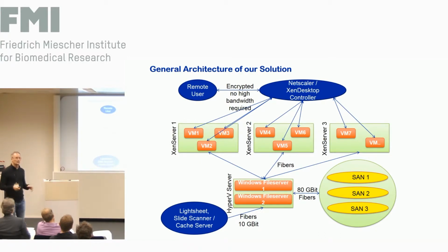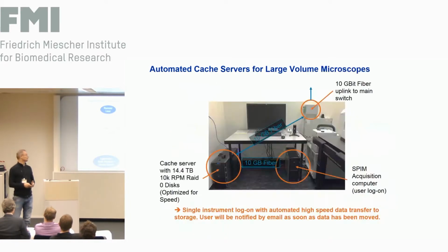Otherwise, you have light sheet users, or users that sit at home. If they want to access the data directly, they have to transfer this 1 terabyte, which is fast down here. But at some point, they should go home, and almost no one has a really high-speed connection at home. So this will never happen, no problems. We never heard of any problems anymore.